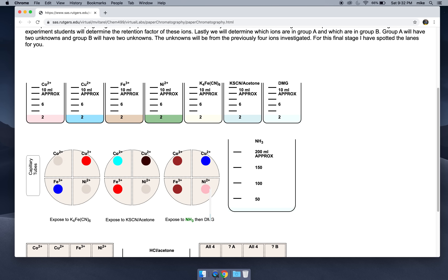Now let's take a look at iron. Notice there's some red here, some red here, some brownish here. But when iron is exposed to K4FeCN6, it turns blue. So why don't we pick K4FeCN6 as our developing reagent for iron?